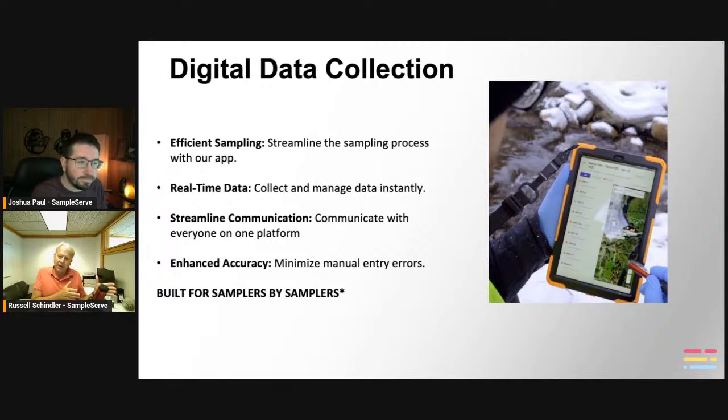Well, if you can't make that field guy's job easier by just scraping the information needed for the chain of custody from the application that he's using to do his job, where he's got to duplicate his work effort in the field, you're probably not going to get a lot of compliance from that field person.